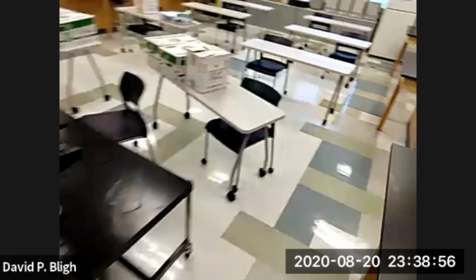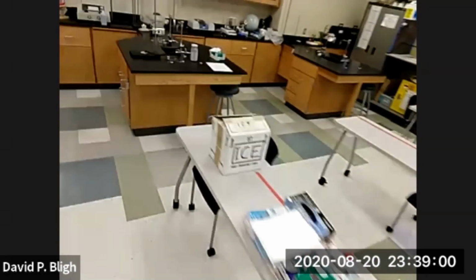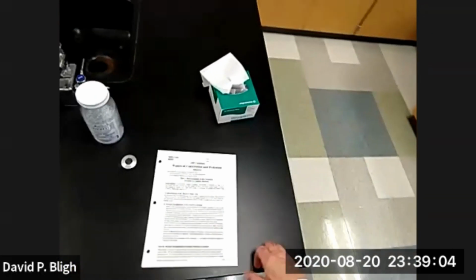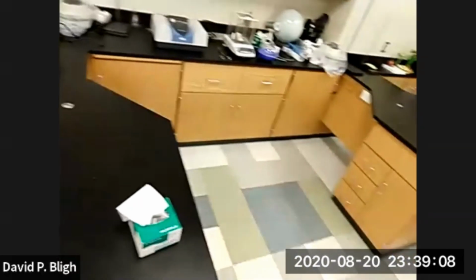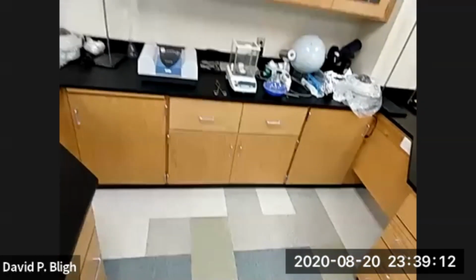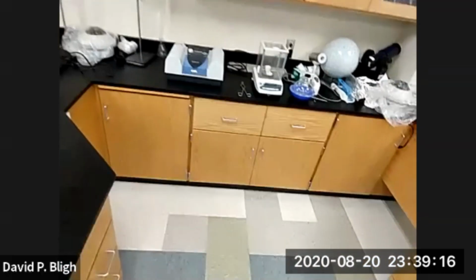Now, the next thing we're going to do is add copper sulfate to it to within, let's see, the procedure calls for 1.9 grams. It doesn't have to be exactly 1.9, but whatever it is, you need to measure it accurately.